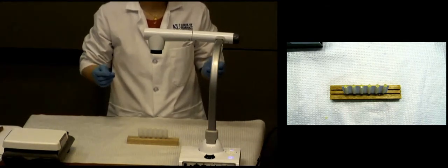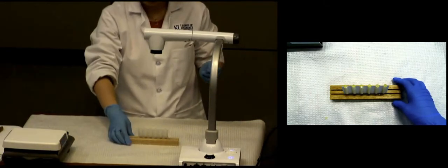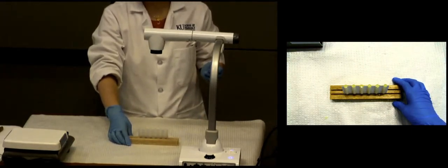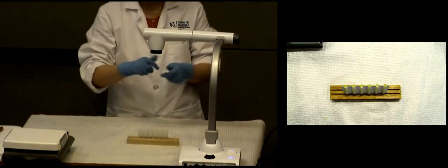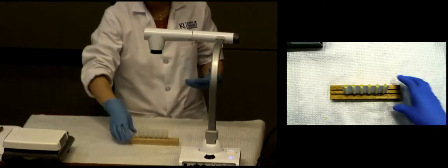If you pull them out or try to take them out before 20 minutes, trust me, they will be so soft, they will still kind of stick to the mold, and they'll ruin them as you try to open it. So you do need to let them congeal for at least 20 minutes. The most common mistake we will see from students is that you rush a little bit, and as you open up, you realize it fell apart because it's not completely solidified yet. All right, so this will take about 20 minutes.